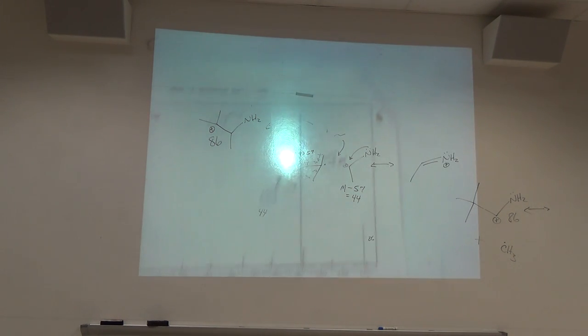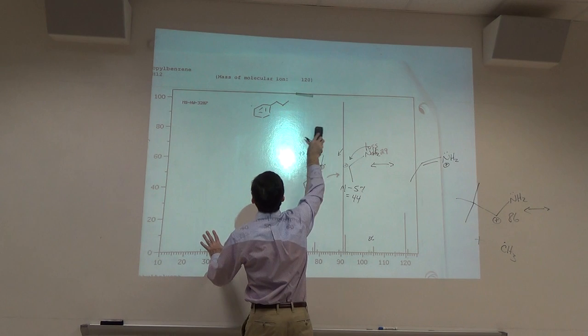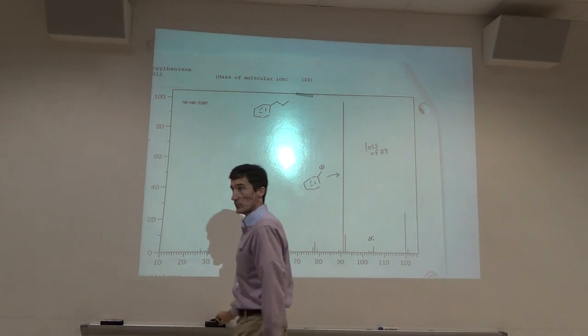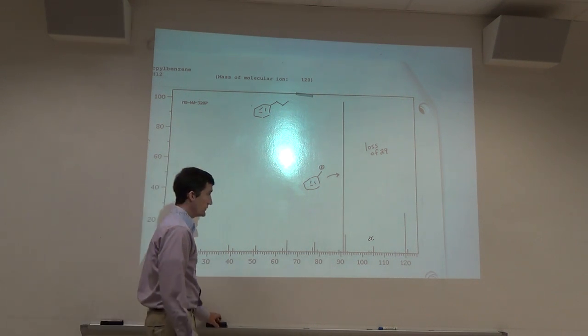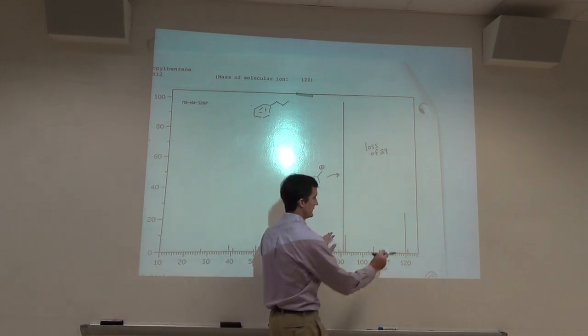Okay, here is a benzene compound with a propyl side chain called propylbenzene. Molecular weight is 120. Again, when you add the molecular weight up, carbon is 12, H is 1, oxygen 16, nitrogen 14, just whole numbers. If you want to do an isotope, then you use the different whole number. 120, do we have a molecular ion? Yes, right here.